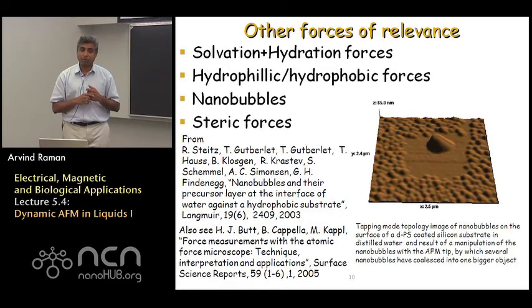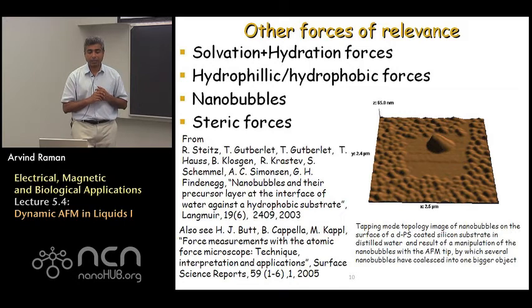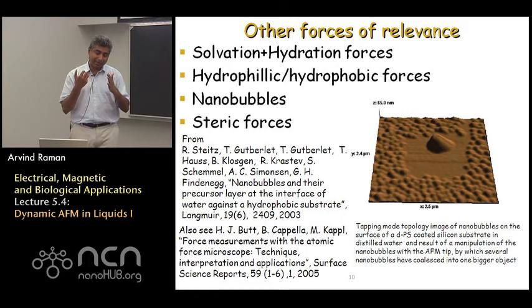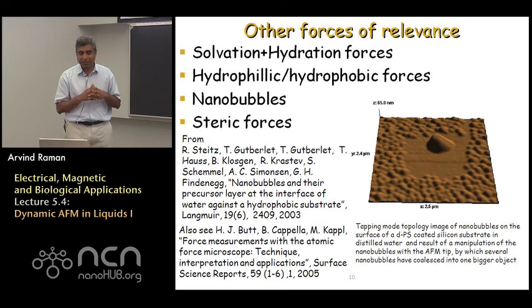In addition, another important force is a hydrophobic interaction force. And this is one of those forces that's still poorly understood. But when you're dealing with hydrophobic tips and samples, basically the hydrophobicity of the surfaces makes it so that the tip and the sample want to remove the water from a substrate. And what ends up happening physically is when you're dealing with a hydrophobic surface in water, you actually end up seeing a lot more adhesion between the tip and the sample. This is because the tip and the sample prefer to be attached to each other rather than having water in between them. And this is a short-range chemical force that leads to increased adhesion between the tip and the sample.